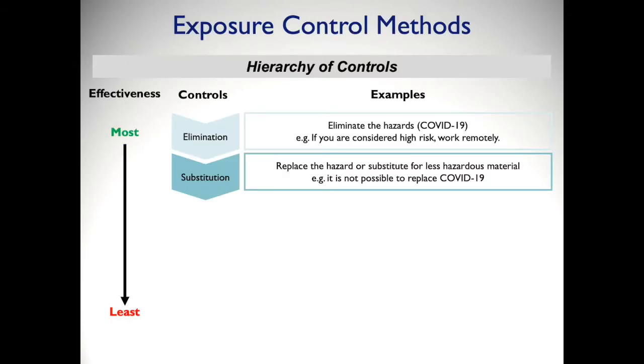If you cannot eliminate the hazard of COVID-19, the next most effective control is to replace the hazard or substitute it for something less hazardous. Unfortunately, in this situation, it is not possible to replace COVID-19 with something else.